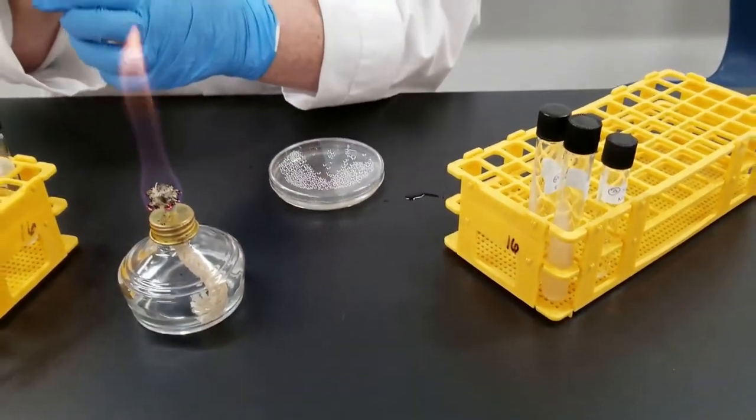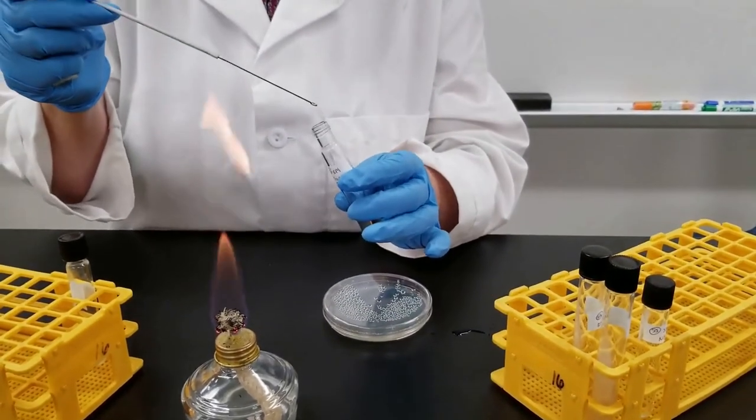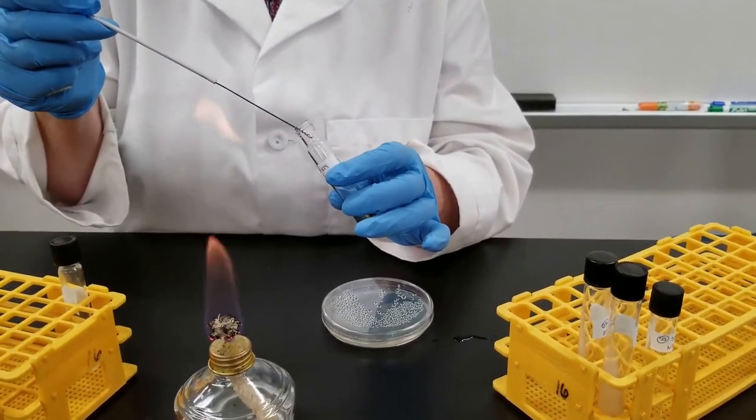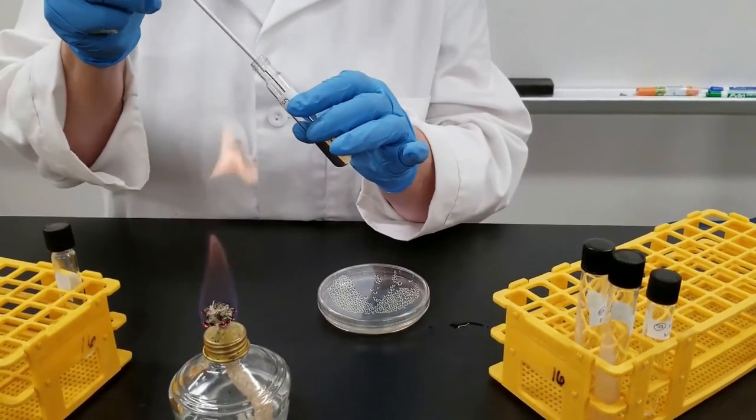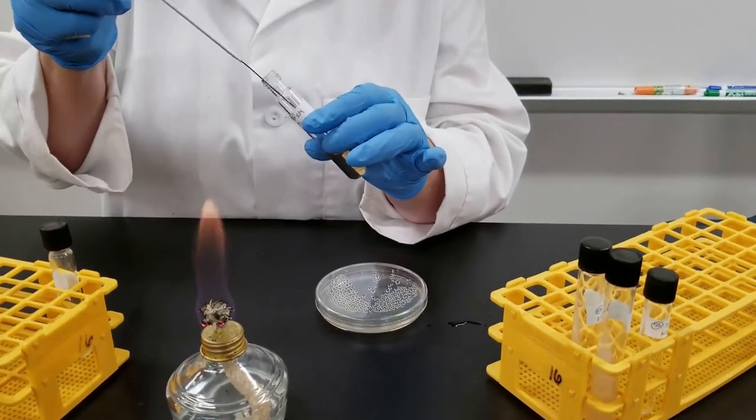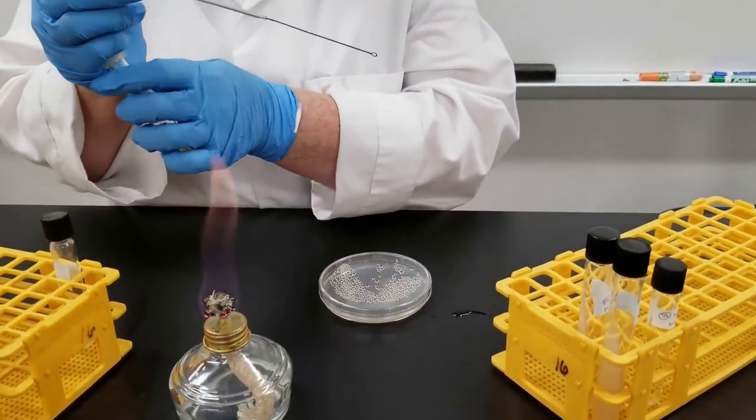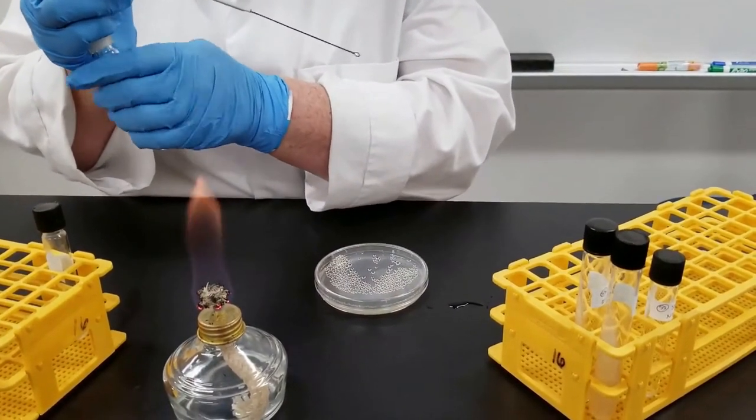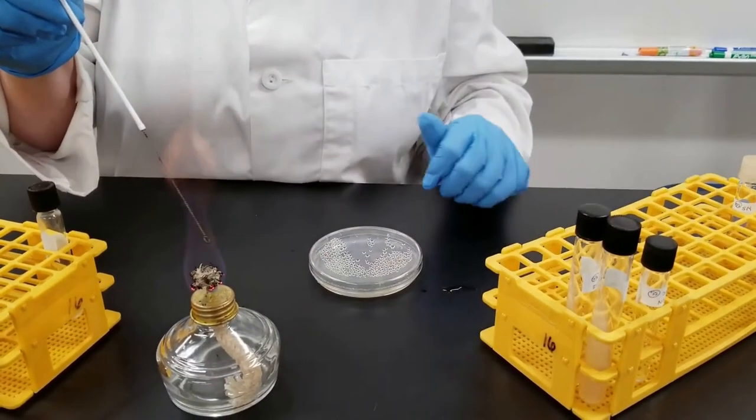With the thioglycollate, you want to obviously flame the tube before you go in. Bring the loop in. Just move it up and down a couple of times in there. Oftentimes when you're using a broth, you may want to touch the loop on the inside of the tube to make sure that the liquid does all be released from that loop and you're not carrying over.